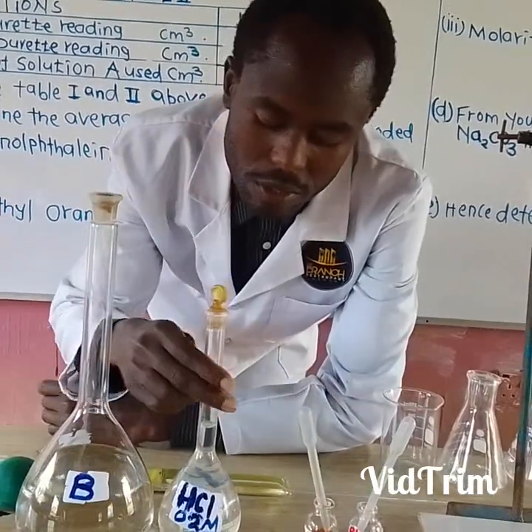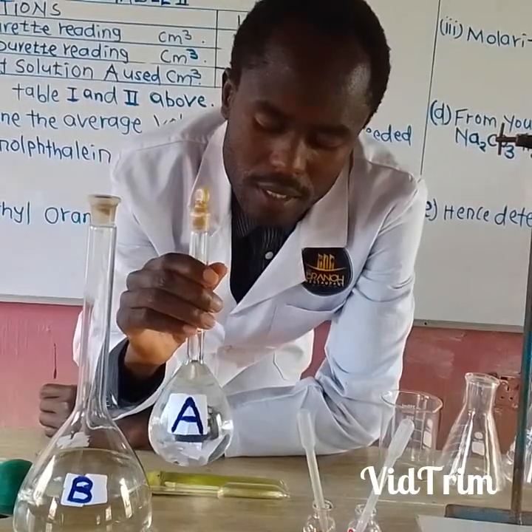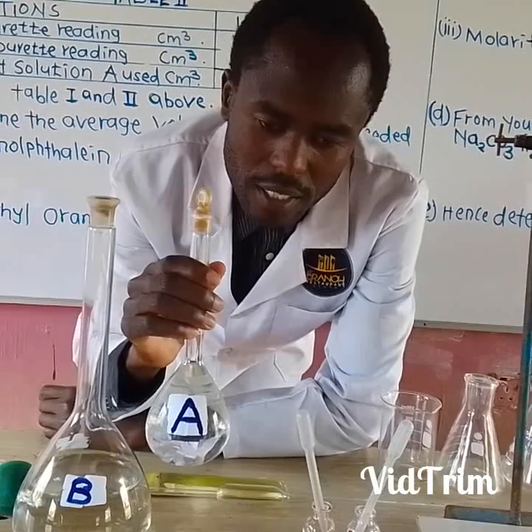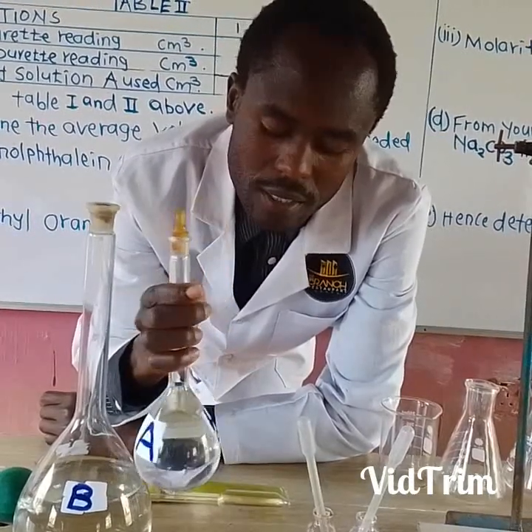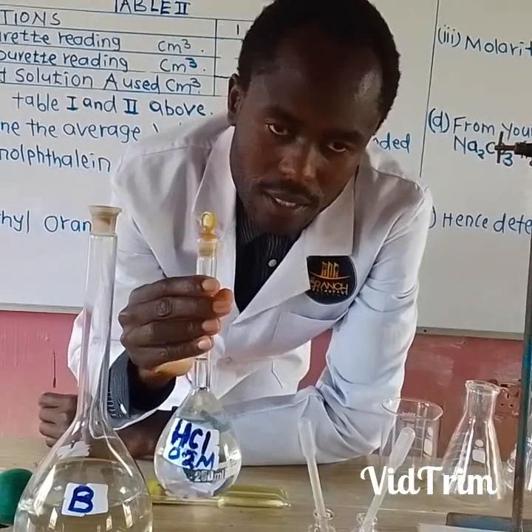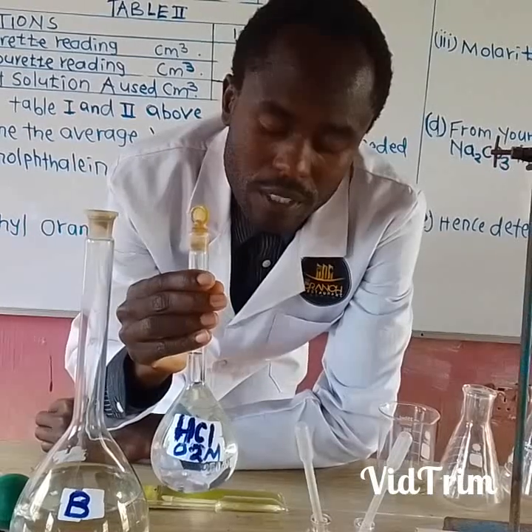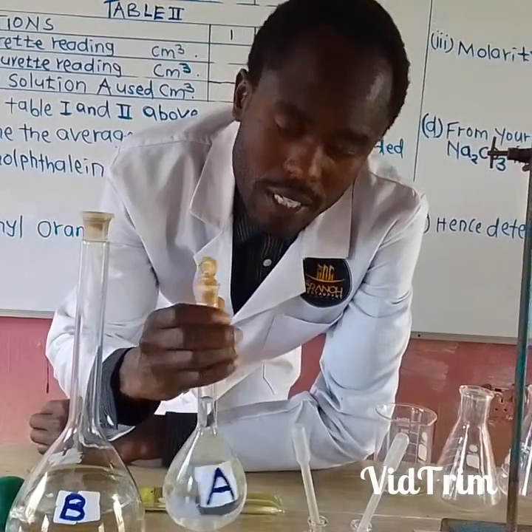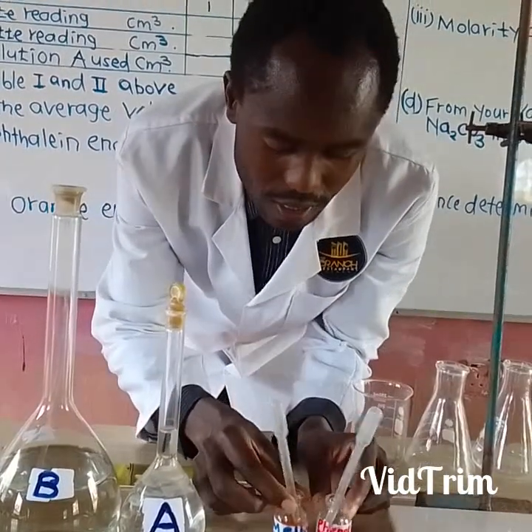Then another solution here labeled as solution A. This is a hydrochloric acid solution, and the molarity is 0.2 molar. Solution A is 0.2 molar.